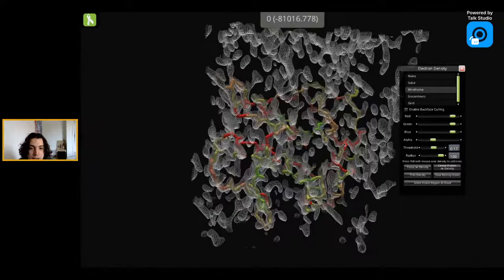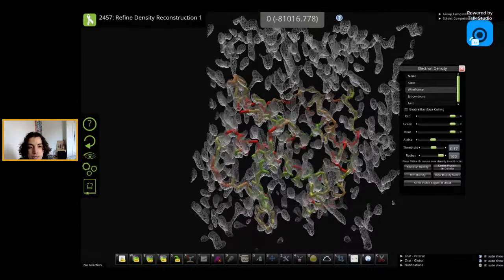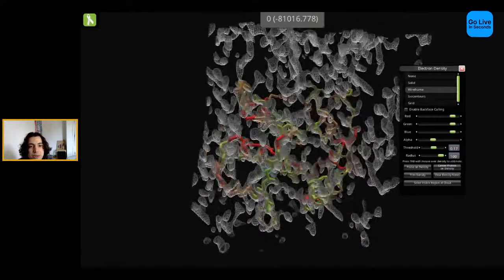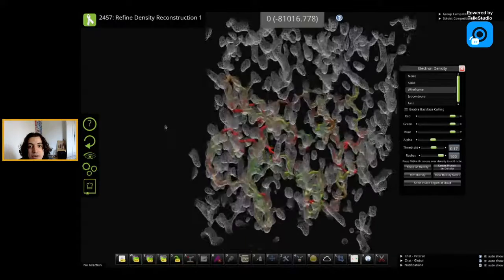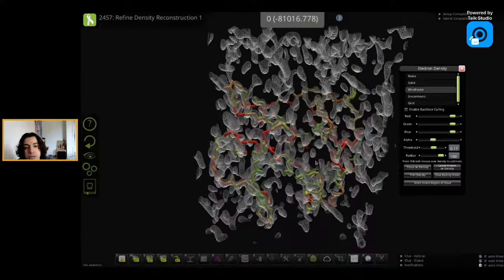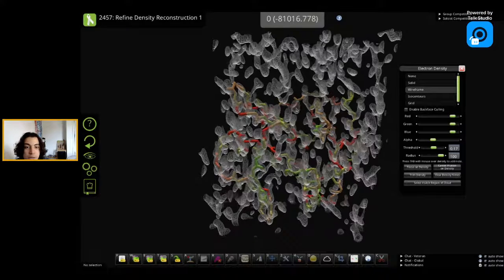There's fully red chains of residues here that still have some density on them, and that might come across as unexpected. But what you really have to look for in terms of the density changing over time is just the overall quality of how it looks. Like you'll notice there's a lot of regions of density here that are kind of just amorphous and don't look like a part of a chain. And in general, it just looks less cohesive. And over time, you'll have to learn to look for density that kind of just looks wrong, because to some degree, it always will follow the model, but you'll just be able to tell it is worse when there's a model that's worse.